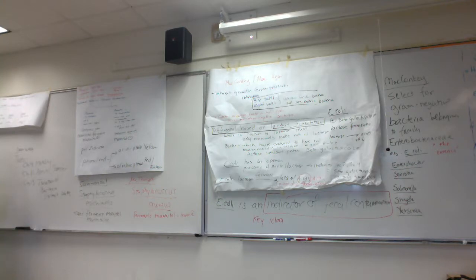And indeed, folks, what we would do, I forgot to mention this in the previous labs, is that we're going to check the airborne plates. So we're going to be counting colonies, counting the total number of colonies, counting the different varieties of colony, and then you're going to choose two colonies to describe the colony morphologies, right? But still, it should be pretty short next week. Do bring your PPE. From now on, the rest of the labs till the end of the semester, every week will need PPE. So just keep it here, right?